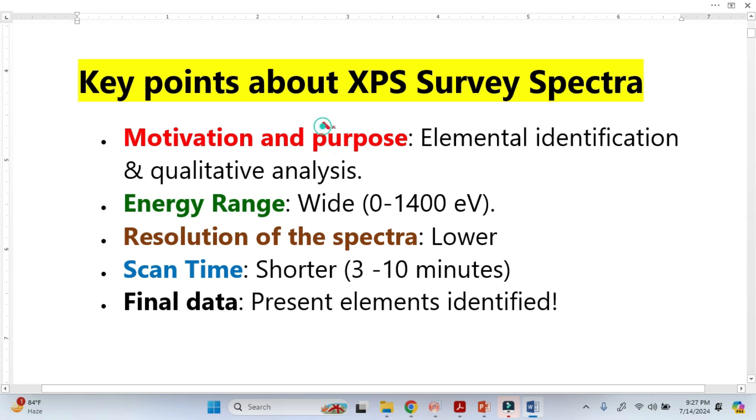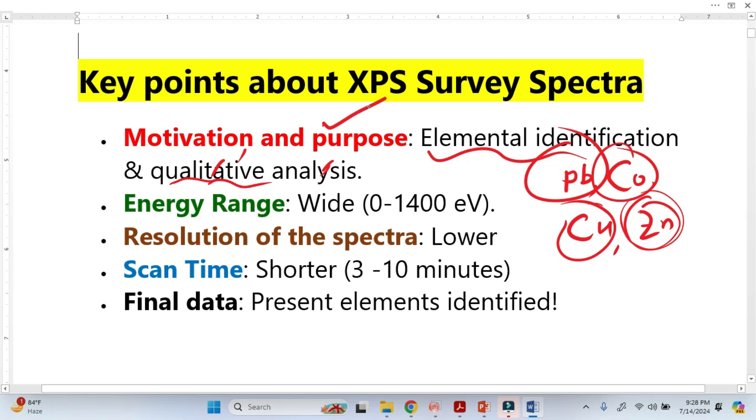These are the key points about XPS survey spectra. The purpose is basically to know the elemental identifications and the qualitative analysis. Qualitative means we are only interested to know the symbol, the symbol means what type of element. Let's suppose this is cobalt here, copper here, and this is basically zinc. We just need to know only the symbols, the elements. This is why we call it qualitative analysis.